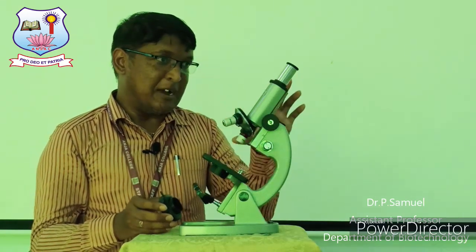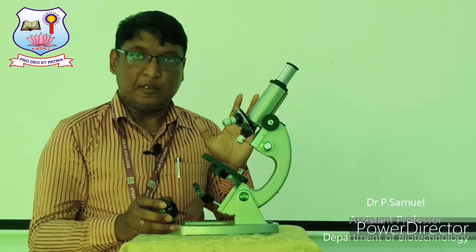The power of each lens is different: 10x, 45x, and 100x. So the maximum magnification power of a compound microscope is 1000x, which means we can magnify the bacteria up to 1000 times its normal dimension, right?